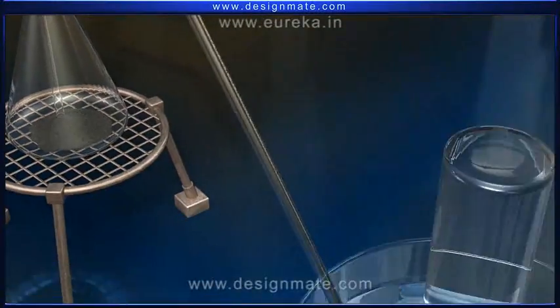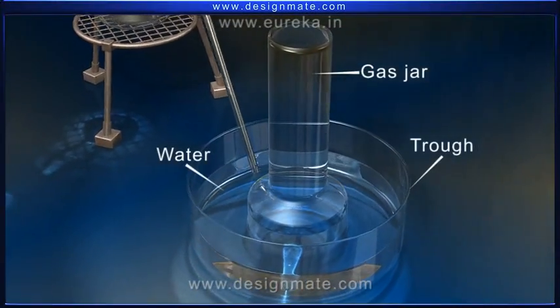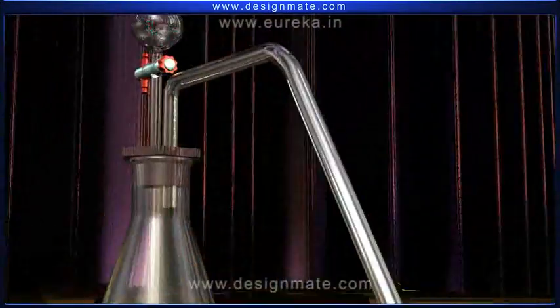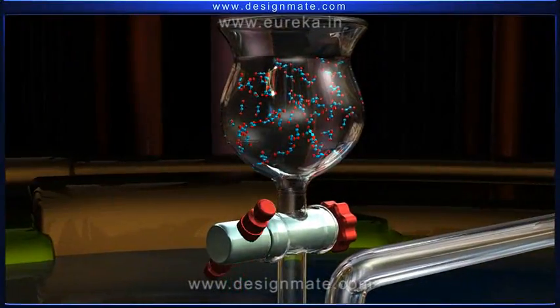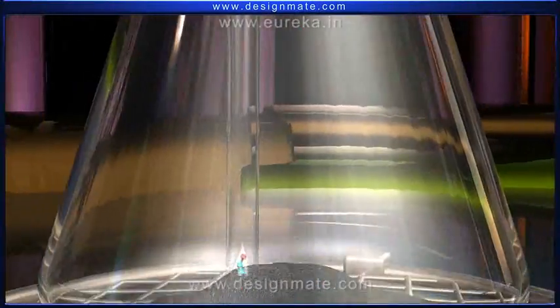The delivery tube leads to an inverted gas jar placed over a trough of water. Now, allow hydrogen peroxide to be added dropwise into manganese dioxide.